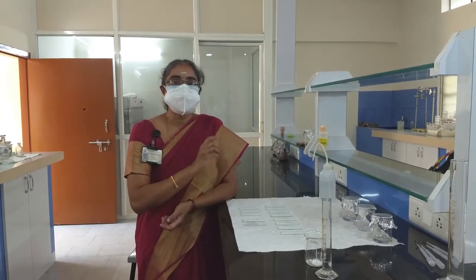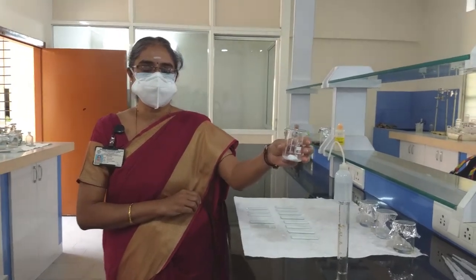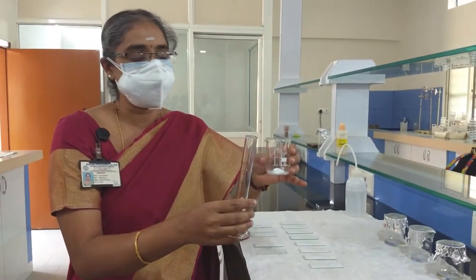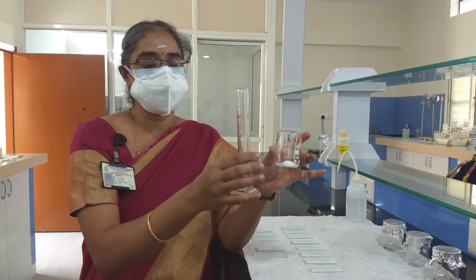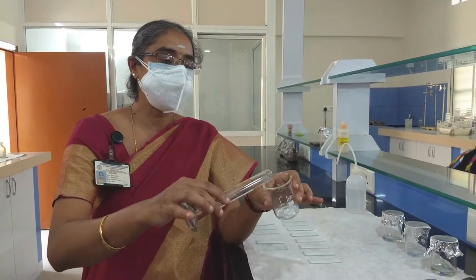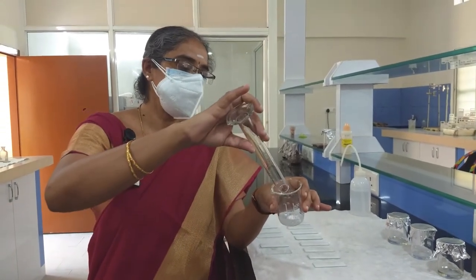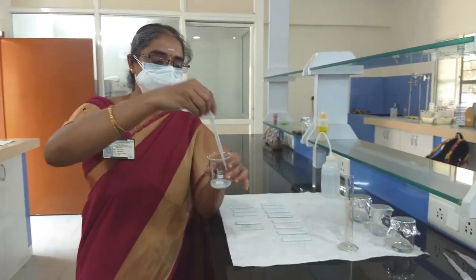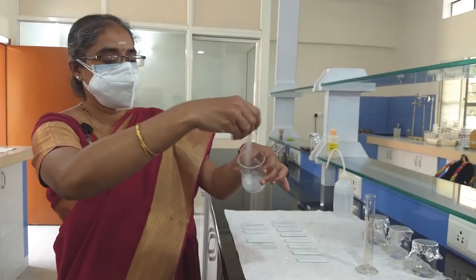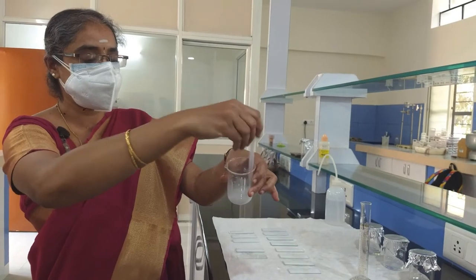We are measuring about 10 grams of silica gel G into a dry glass beaker. For every 10 grams of silica gel G, we measure approximately 24 ml of distilled water. After pouring the water into the silica gel G, mix it to prepare a proper slurry with no lumps in the mixture.